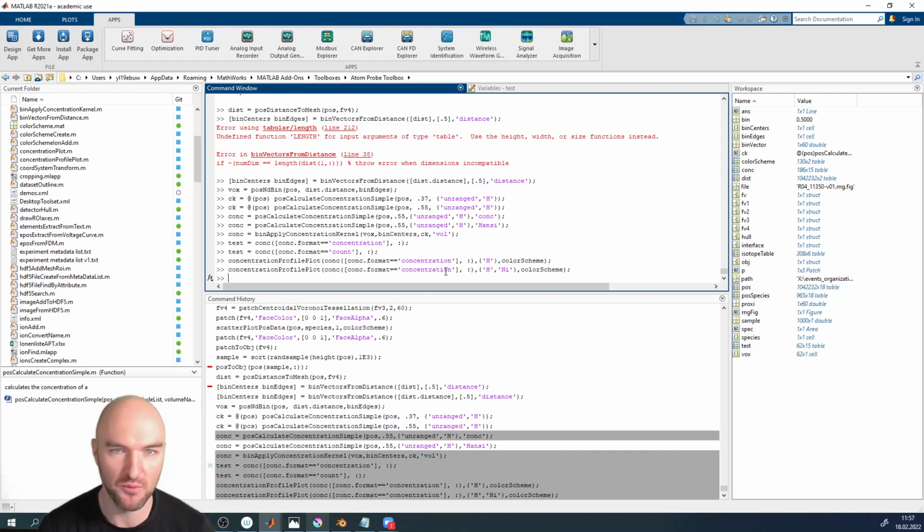And to that end, we're actually going to abandon this small data set because voxelizations in this tiny data set are not that interesting. And we're going to take the data set that I used yesterday, where we created the isosurface, and create an iso concentration surface in this data set. And so I'm going to clear out all of the stuff that we have here.